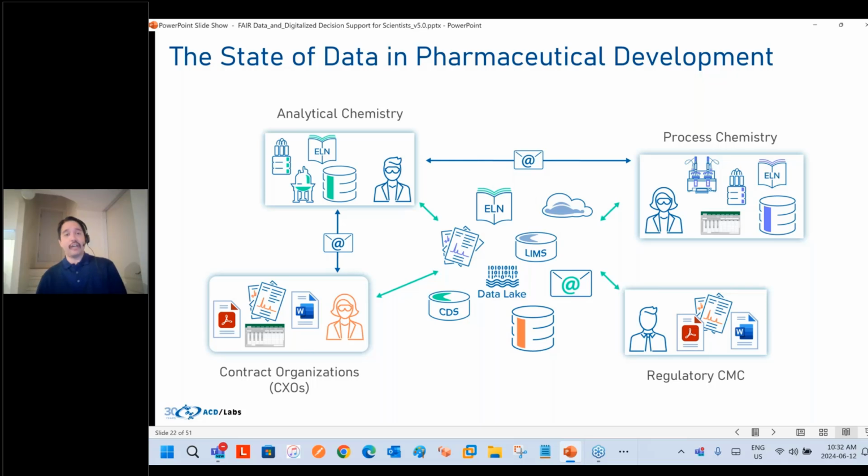Now, when they want to share that knowledge, most likely they're using something like Microsoft Office and Excel, but it's not standardized. And again, going to the other side, for the process chemists, maybe they have a notebook that's specific for them. Maybe they have access to a lab reactor, again, for their cases, such as the EasyMax. And again, open access to NMR or an LC. But when they want to share that information, again, it's not standardized. And this becomes very painful when you really need to summarize everything within the project, and especially if there are several different spreadsheets being used.